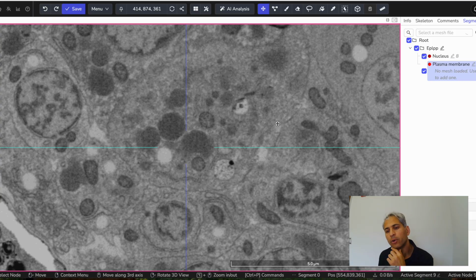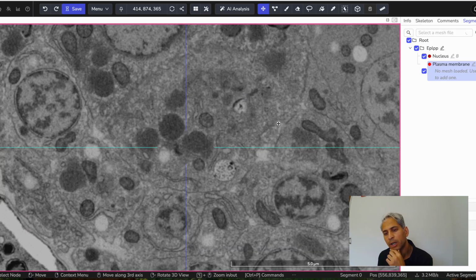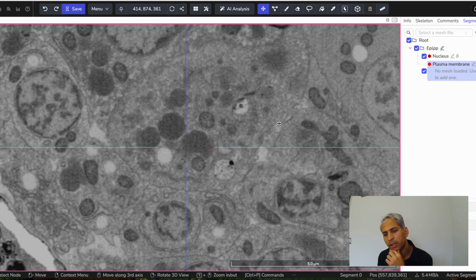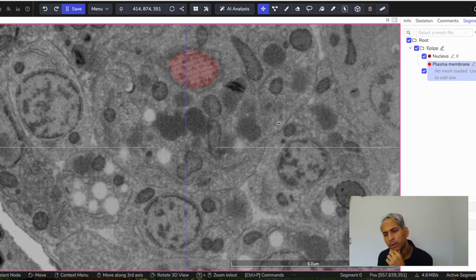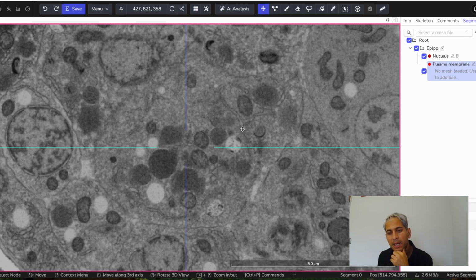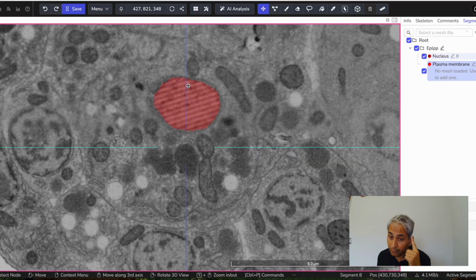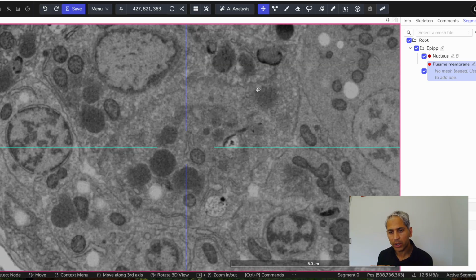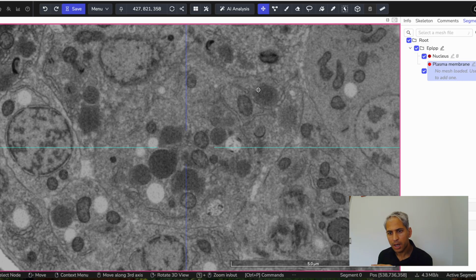Therefore, I'm going to do something. I'm going to go up and down a little bit. Up and down. Up and down. Oh, now I'm going to make a nice reasoning. Suddenly, here's my nucleus. Therefore, my plasma membrane already stretched all the way here. So it's not far-fetched that the cell is expanding quickly in its territory.